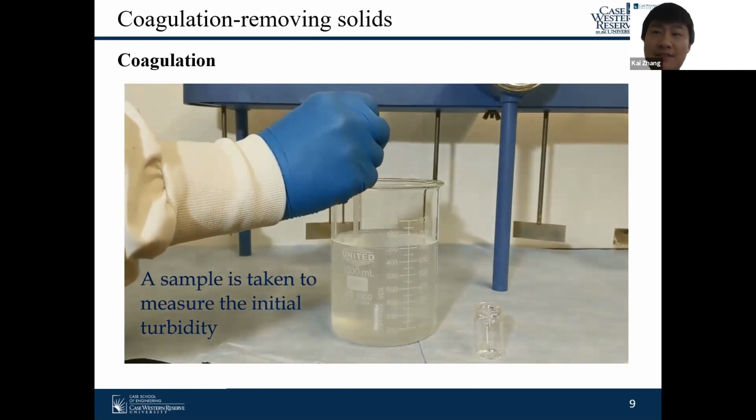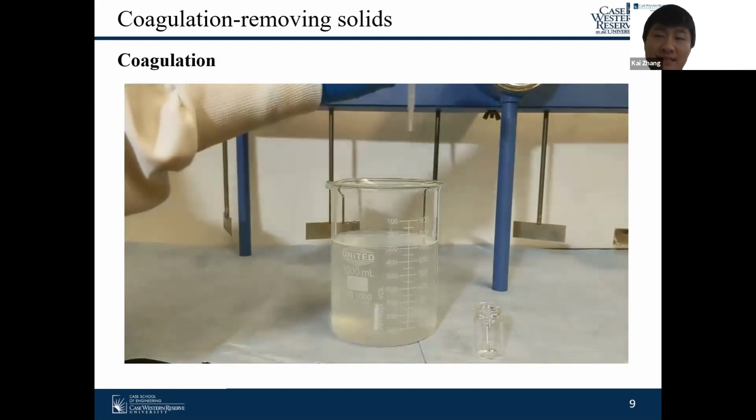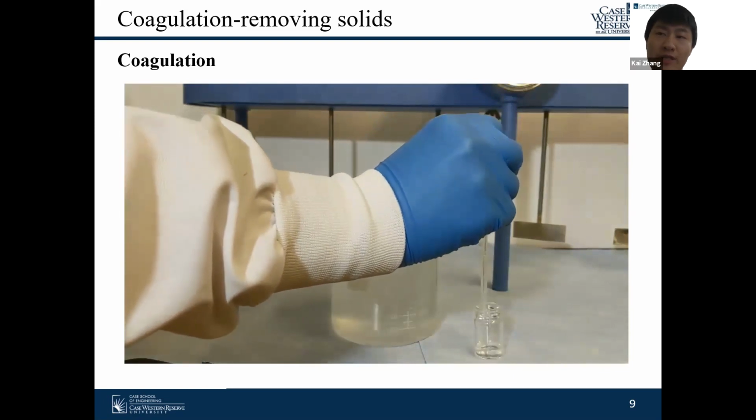Now it starts to measure how many solids are in this untreated water.